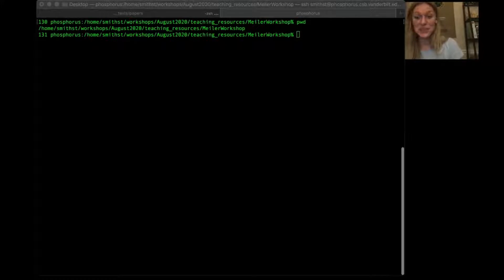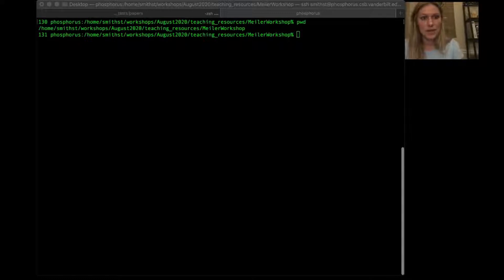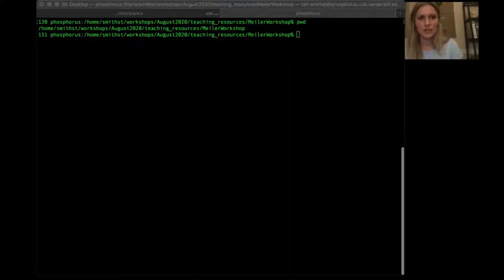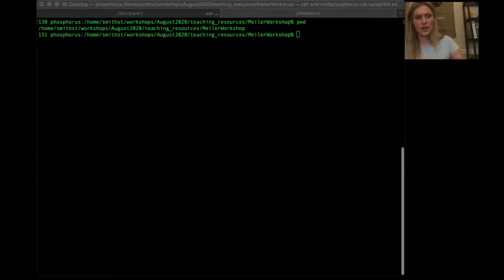Hi everyone, welcome back to the next section of the workshop. My name is Shannon Smith — I did the ligand docking presentation, and now I'm going to be walking through the tutorial with you. I have my terminal open, and I'll walk through each of the scripts for you to follow along and ask questions. A note: my paths will look a little different from yours when we call Rosetta. Also, I can't open PyMOL in my current setup, but you are encouraged to do so on your screen.